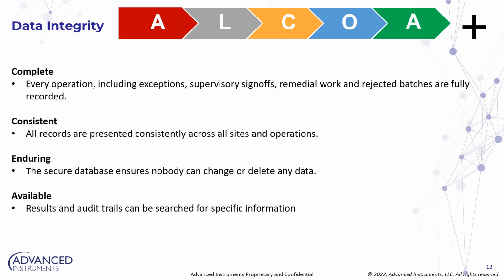So availability here really talks a little bit about the data connectivity part, which is a very critical part of data integrity. They sort of go hand in hand. You have data that's fully complete, it's accurate, it's attributable, it's legible, original. But if it's not easily accessible or available to review, to audit, then there is a concern there. So that's really where the ALCOA Plus comes in.